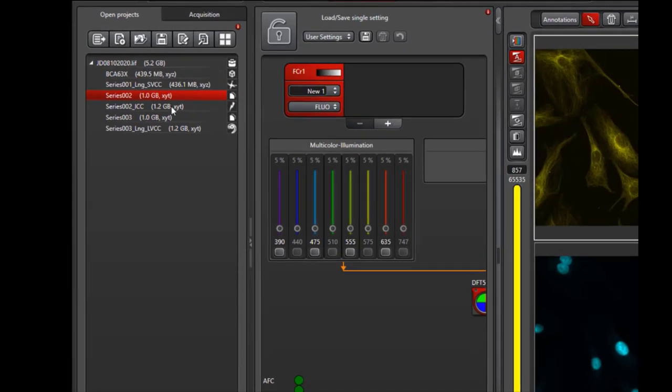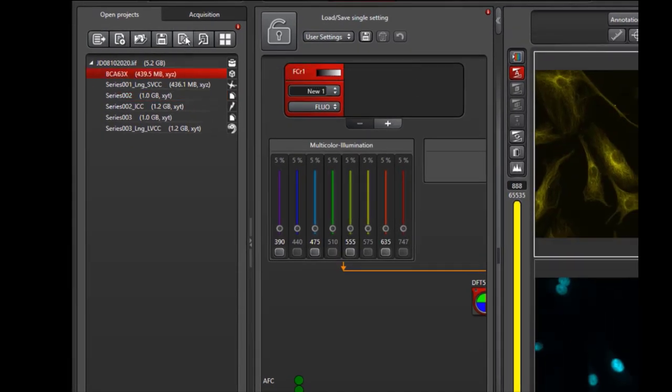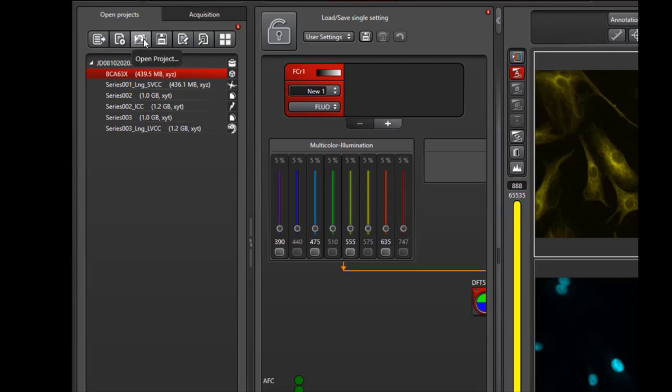You can also apply settings by selecting any image from the list and pressing the Apply button within the toolbar. From the toolbar, you can also create a new project, open an existing project, or save all projects.